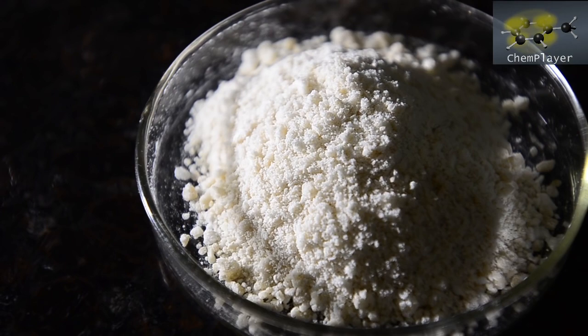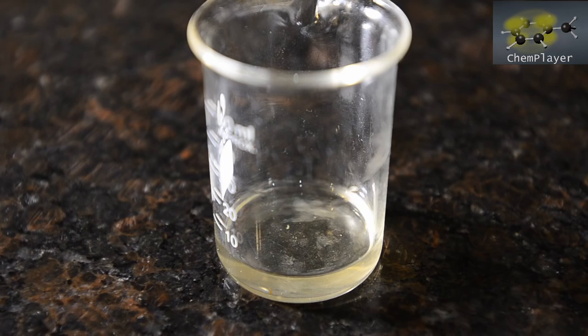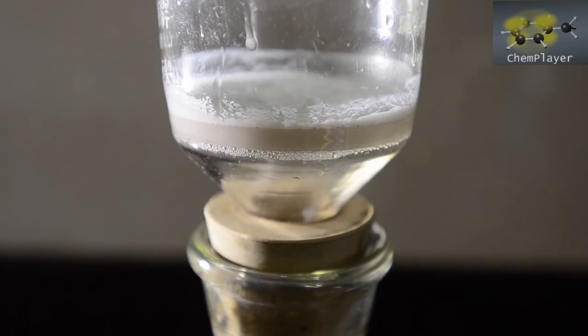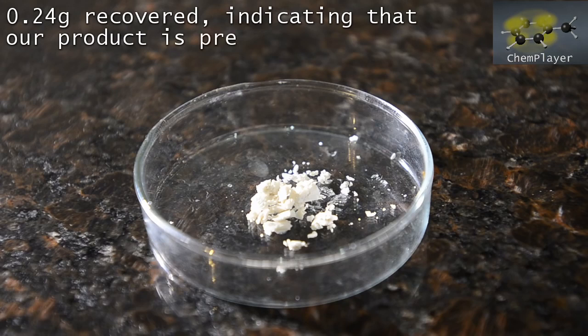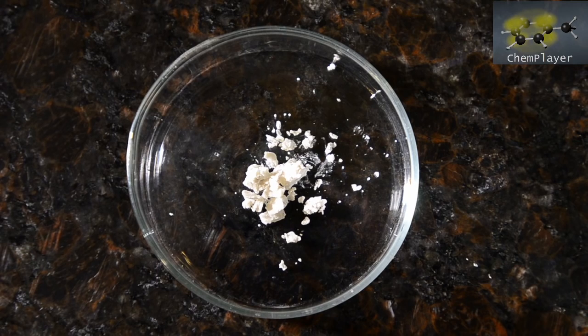We'd like to recrystallize this, but we can't find out what solvent to use. We did do a small experiment though by dissolving about 1/4 gram in methanol to form a solution. Then we added some ethyl ether. The piperidine hydrochloride precipitates and can be filtered off. So this is one method to purify to obtain a white solid, if you want to. So there we go. The YouTube first, piperidine from pyridine via reduction using sodium metal in ethanol.